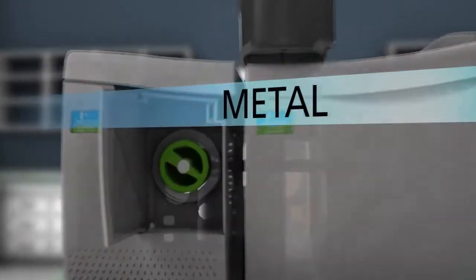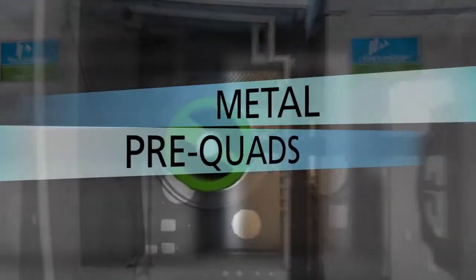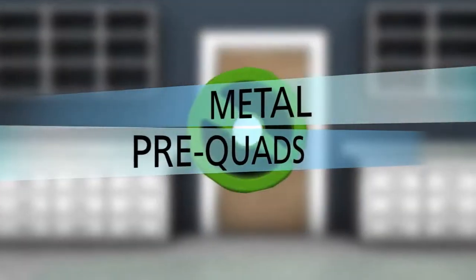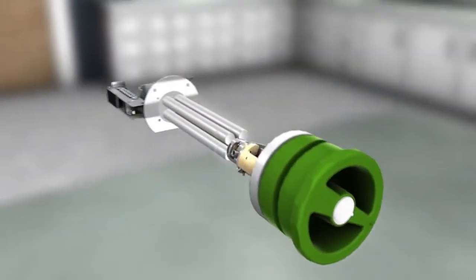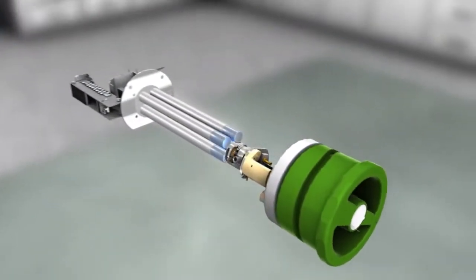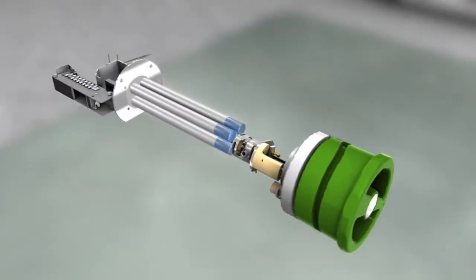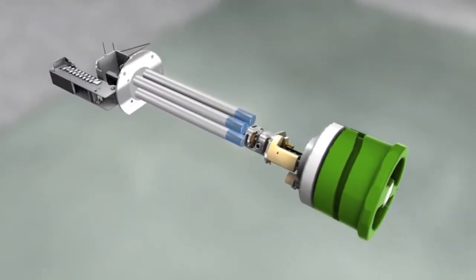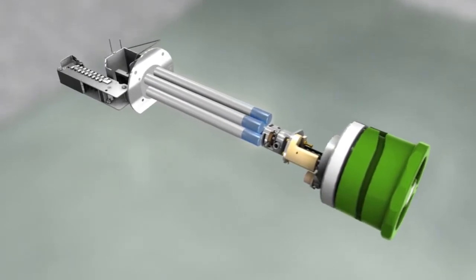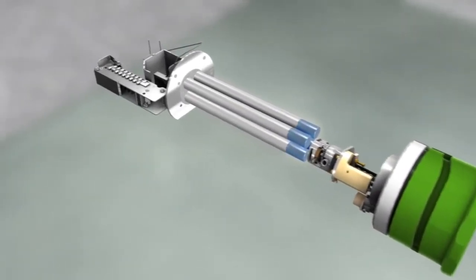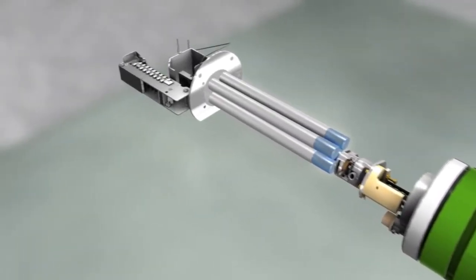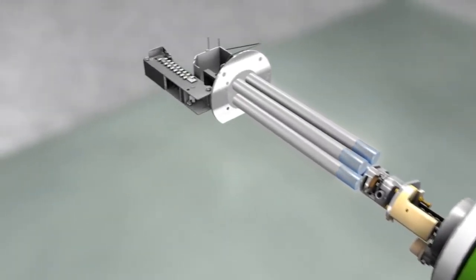A set of pre-quads removes ions outside your range of interest before they enter the analyzing quadrupole. Accessible and removable, this initial filter can be cleaned to return the instrument to as-new performance levels.